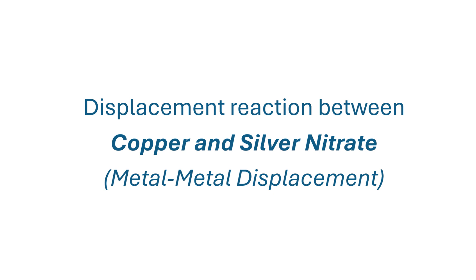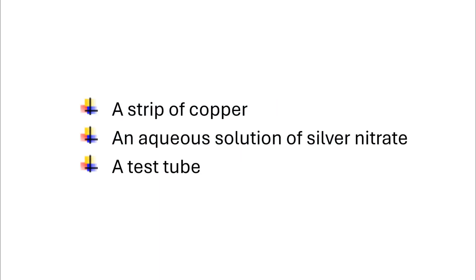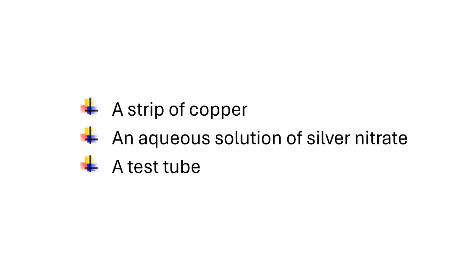To perform this experiment you'll need the following: a strip of copper, an aqueous solution of silver nitrate, and a test tube.